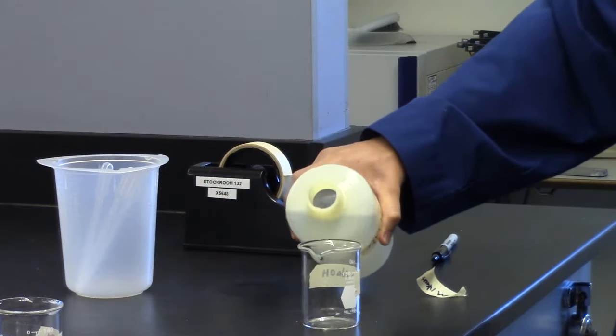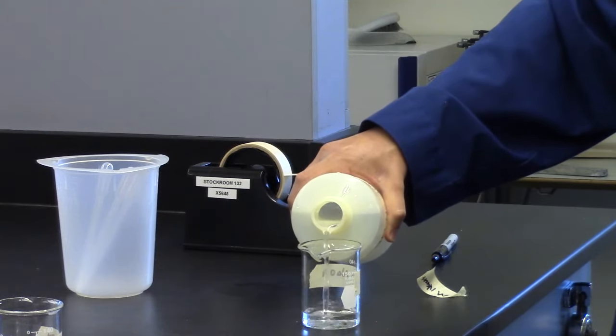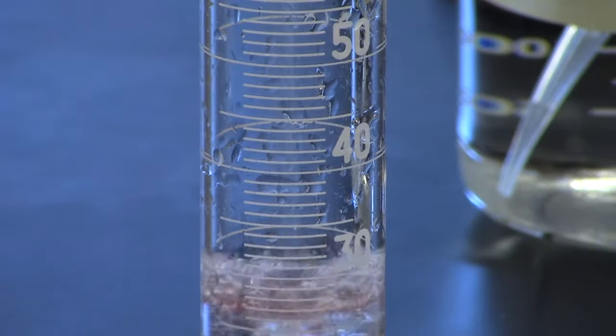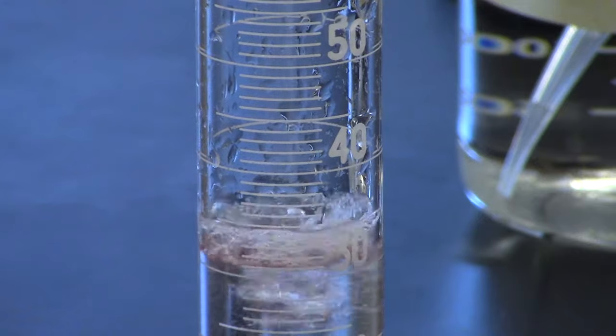Obtain 3.0 molar sodium hydroxide. Pour it into a beaker. Using a 100 ml graduated cylinder, measure out approximately 33 ml of sodium hydroxide.